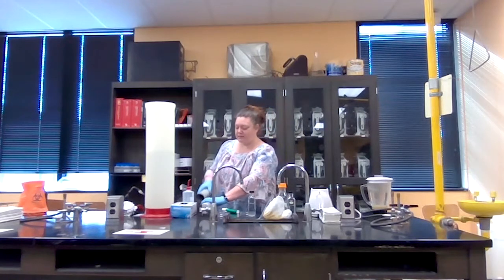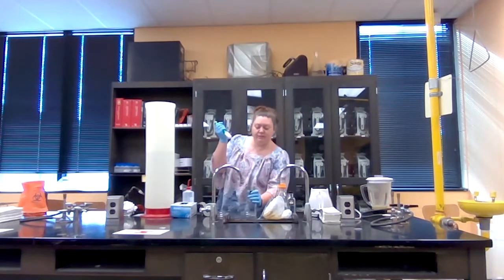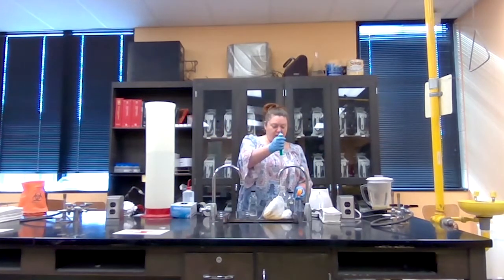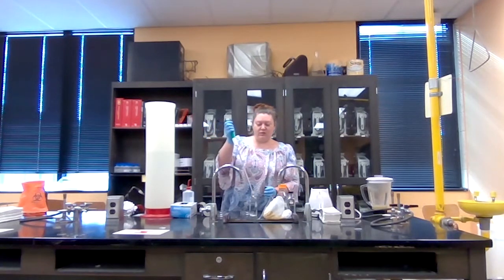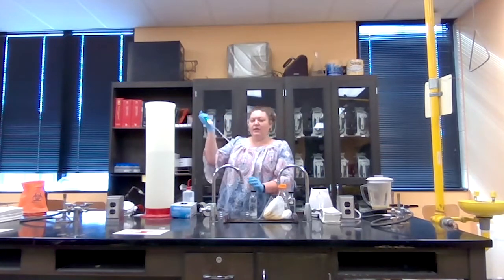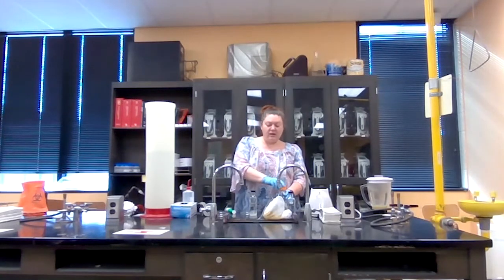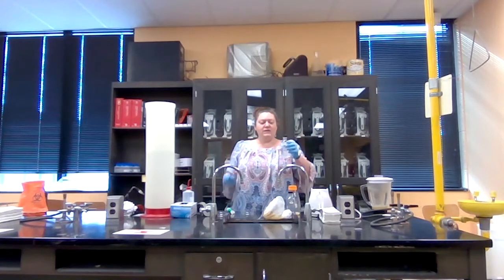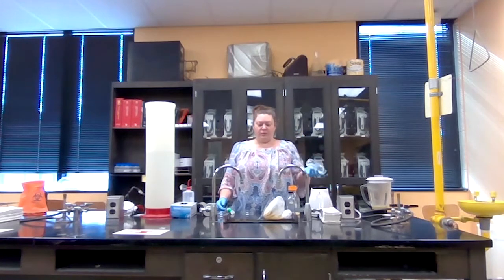So taking the pipette, and the pipette is going to be sterile, of course, using our pipette aid, I'm going to put it here. And then I'm going to remove 1 milliliter from this, and this is already diluted. Remember, it's a 1 to 10 dilution. If you put that into scientific notation, that would be a 10 to the negative 1 dilution. So what I did here is I took 1 milliliter of a 10 to the negative 1 dilution, and then I made another 1 to 100 dilution out of it. So what's inside of here, all told, is a 1 to 1,000 dilution of the Taco Bell taco.